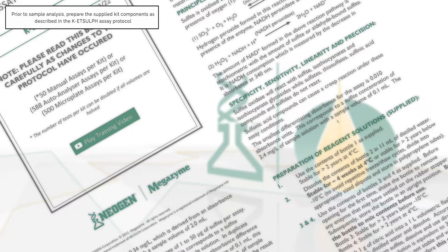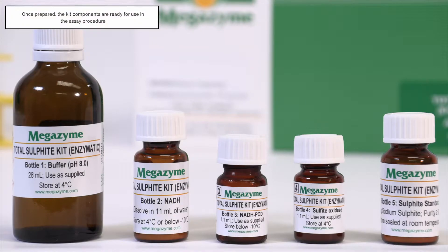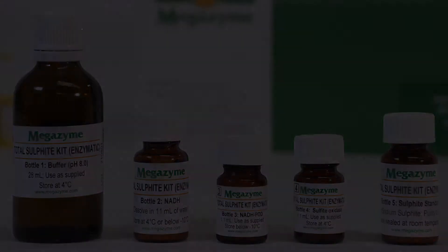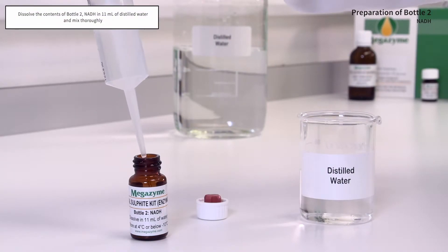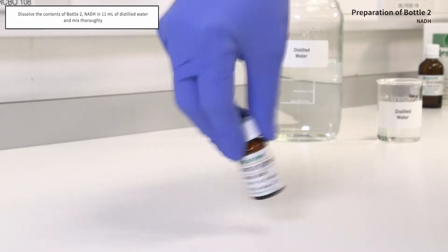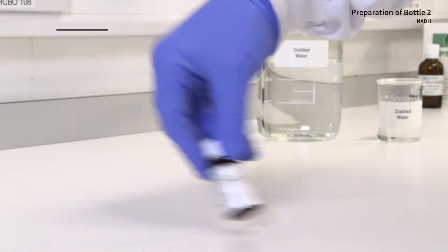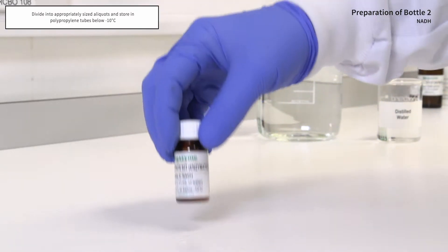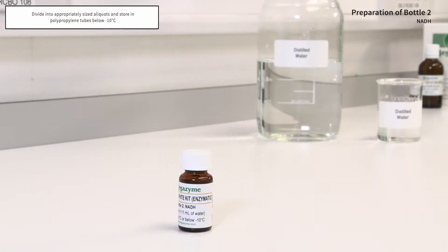Prior to sample analysis, prepare the supplied kit components as described in the kit assay protocol. Once prepared, they are ready for use in the assay procedure. Use the contents of bottles 1, 3 and 4 as supplied. The contents of bottle 2 are dissolved in 11 millilitres of distilled water. The bottle is capped and the contents are mixed thoroughly. Divide into appropriately sized aliquots and store in polypropylene tubes below minus 10 degrees Celsius.